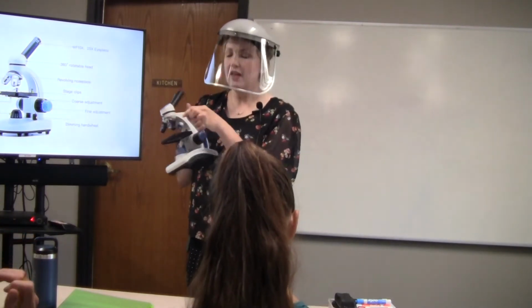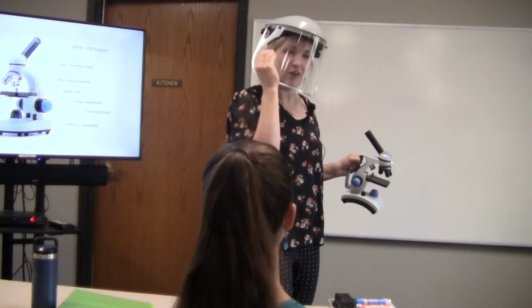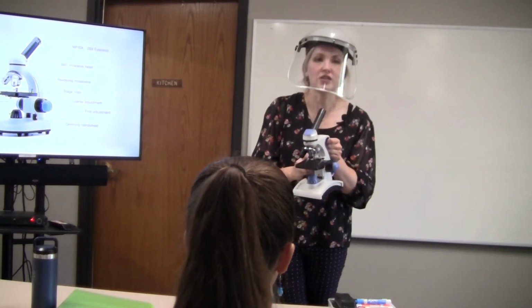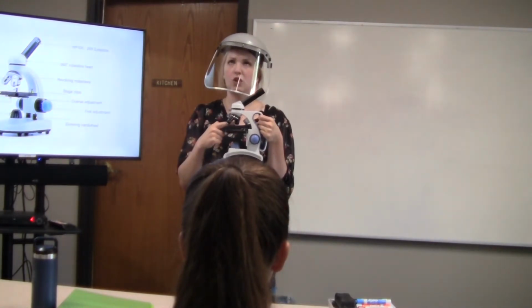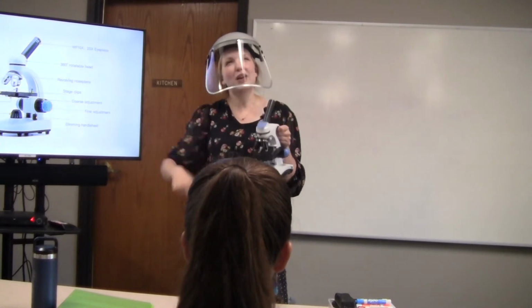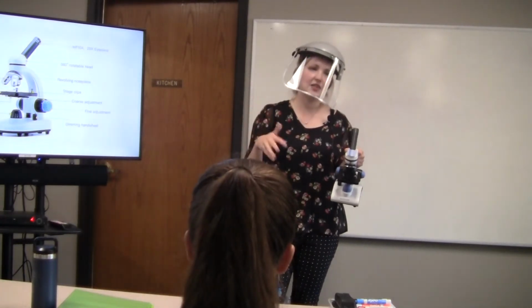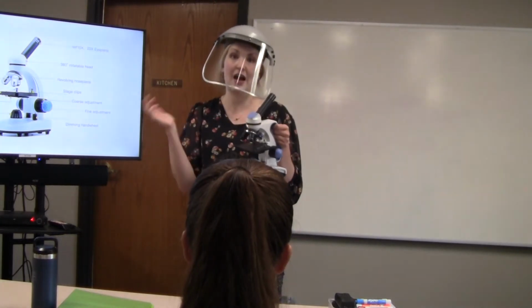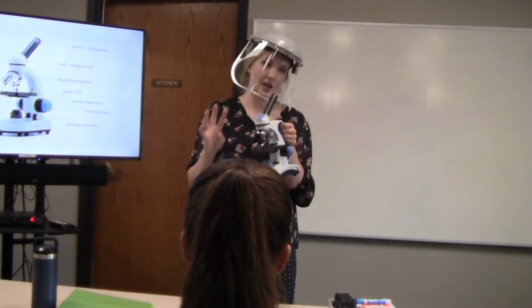When you are set at the 4 times magnification, this is important, so if you're not paying very close attention right now, tune in. You only use the coarse adjustment at the 4 times. So it's not magnifying things the most. It's magnifying things the least because it's only magnifying it 4 times. 40 times would be the highest magnification. So you only use the coarse adjustment on the 4 times.